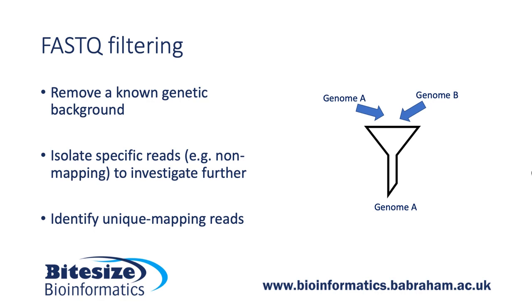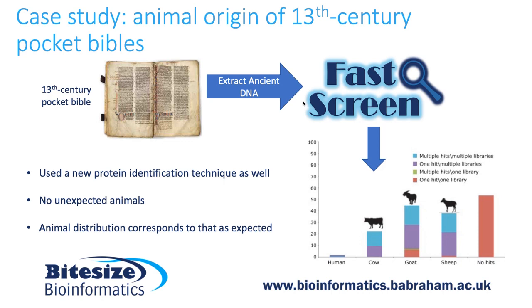So that's a brief note on the filtering of FastQ files. It is interesting how a tool that was originally designed as a bit of QC software can then go on to perform analysis and filtering in its own right. I just wanted to talk briefly about a couple of interesting asides regarding FastQ Screen. When you write a bit of software, it can be quite interesting to see how other people are using it and the diverse range of applications to which it can be put. I'm going to discuss two of the most notable of these.